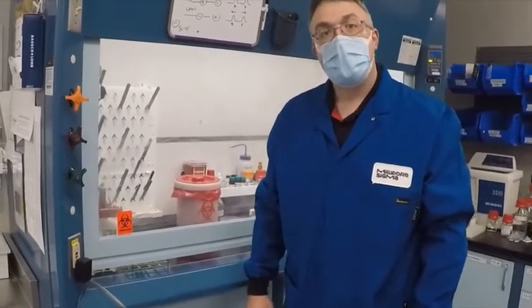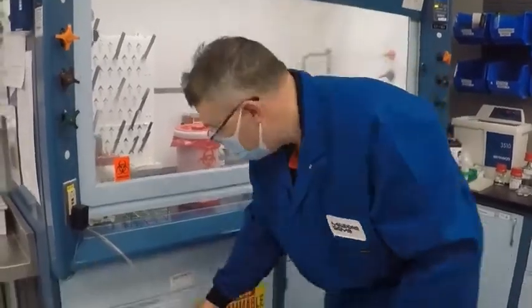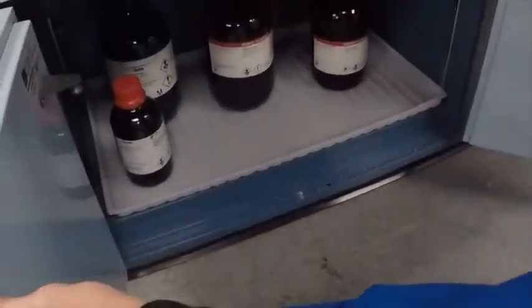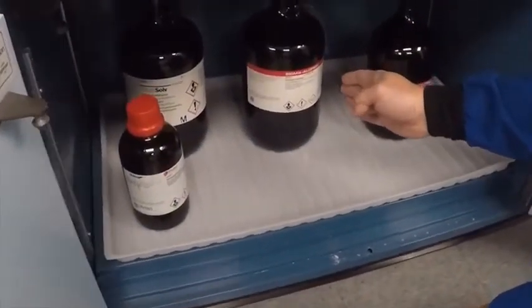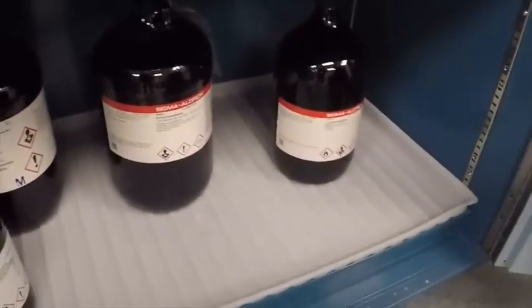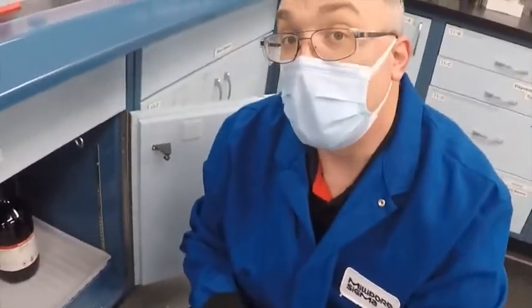One last cabinet to talk about: we need to separate our toxic materials from our flammables. In a typical analytical laboratory we'll find chlorinated materials — dichloromethane, methylene chloride, or chloroform. Any chemical designated as a toxin cannot be stored with a flammable. Please check with your EH&S manager for proper storage of your chemicals.